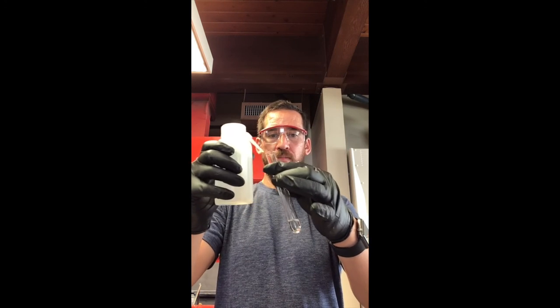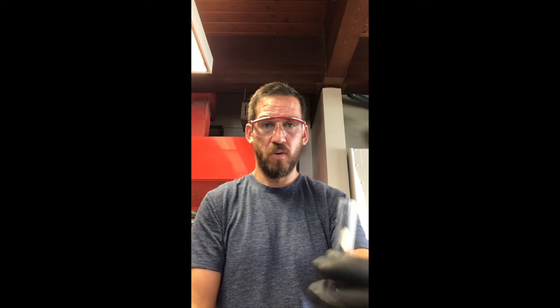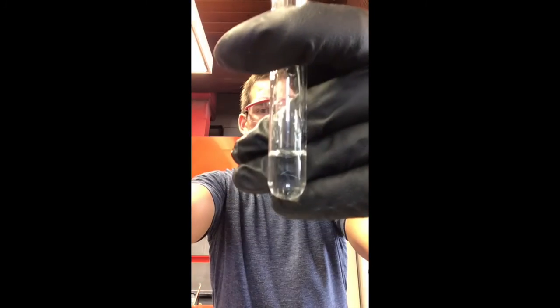So we've got another tube right here. We've got water, okay, and we've got the last unknown. Okay, so let's put that in here, and we should know what to expect when we look at those unknowns. So notice there's only 1 layer. There's not 2 layers, and it just gets bigger and bigger. Okay, so we can differentiate between the organic layers right now.